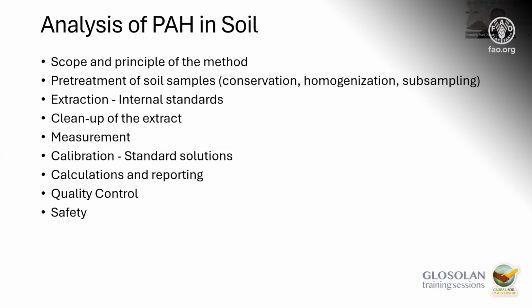I will also talk about the calibration of the instrument, the standard solutions, how we do the calculations and the reporting, and also important, the quality control and the safety issues involved with this analysis.